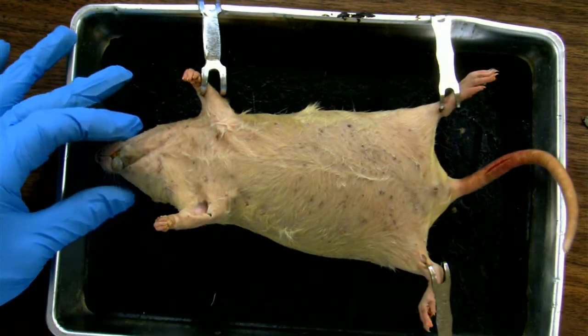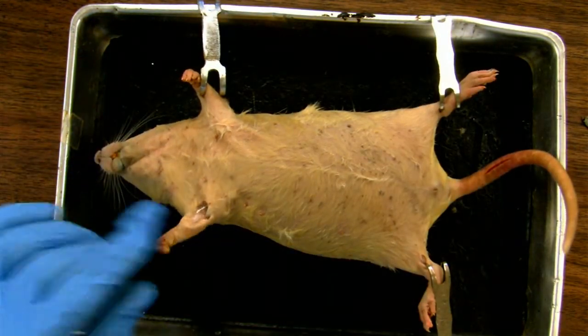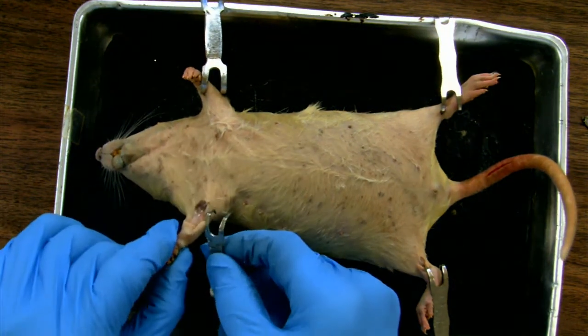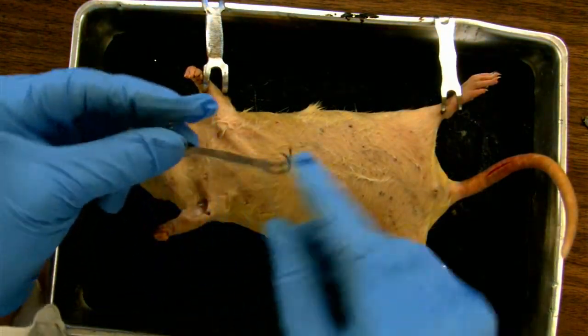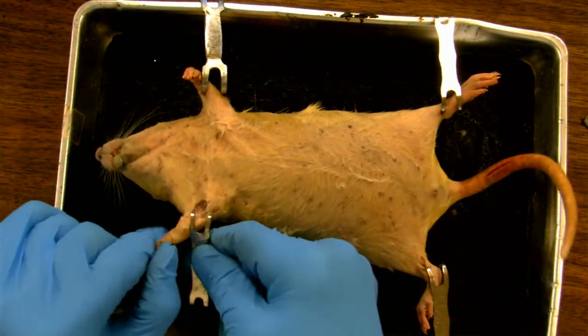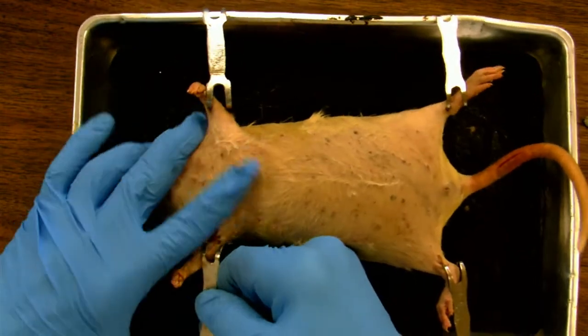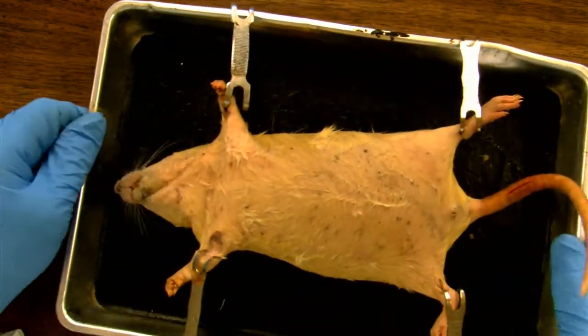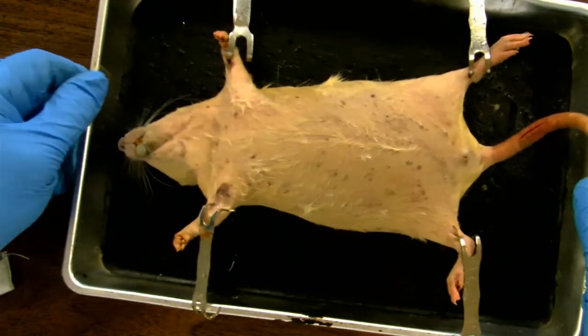I'm going to start dissecting the female rat first, but before we start dissecting, we have to secure this animal to the tray. To do that, we use these devices called flesh hooks. They hook around one part of the animal, usually one of the limbs, and to the edge of the tray, and that spreads the animal out and secures it nicely to the tray.